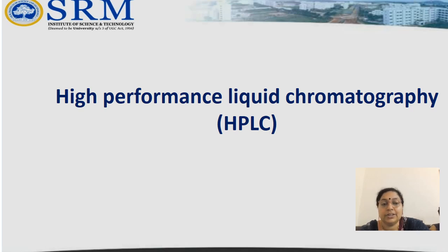Hello friends, today I would like to explain about high performance liquid chromatography. It is a kind of liquid chromatography and it is commonly used for qualitative and quantitative analysis.